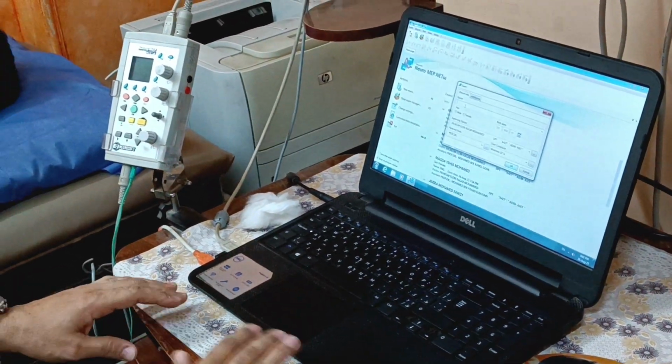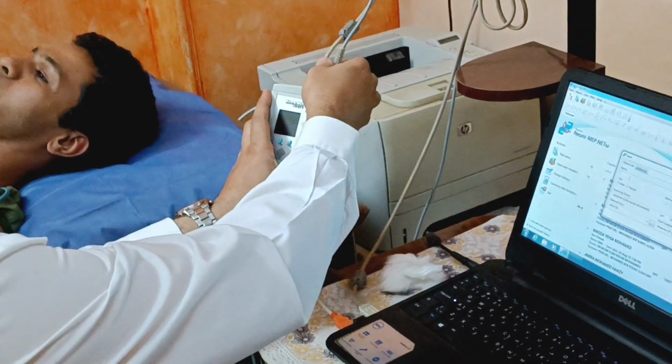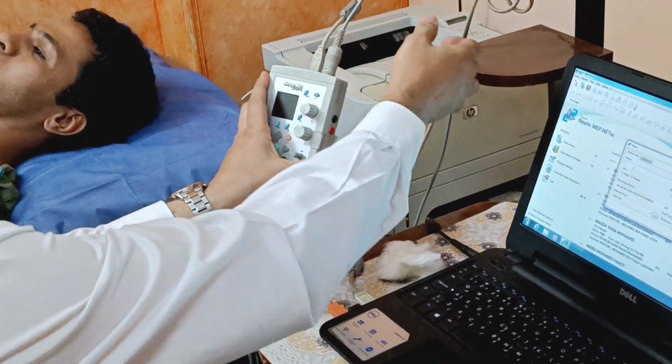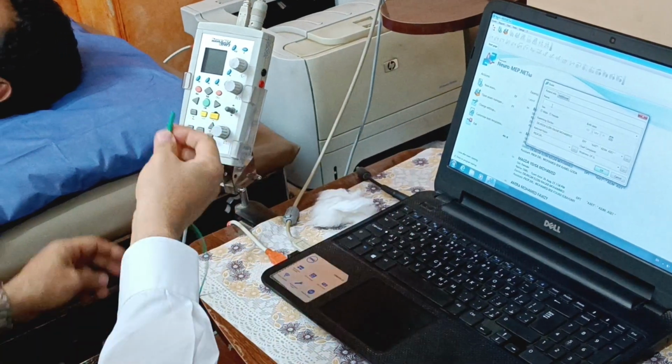First of all, it must have an amplifier. This amplifier will be connected with cables. Also, it will be connected with the laptop or the PC. Always we have some connection of certain wires, which I will talk about later.